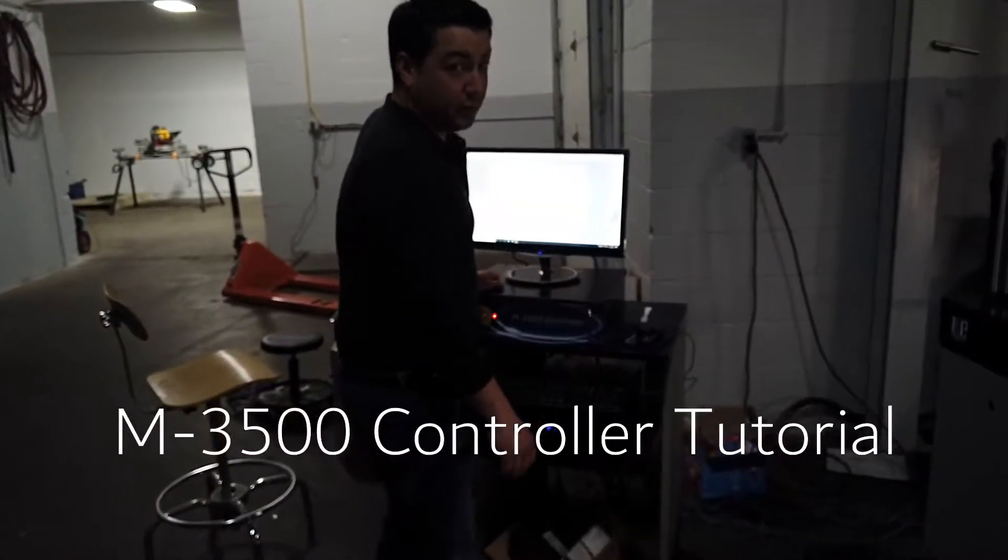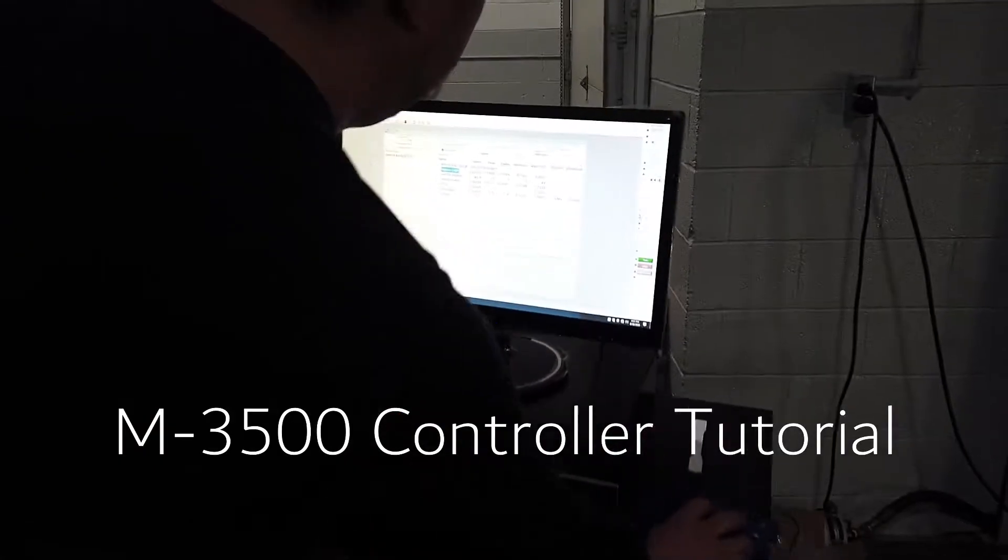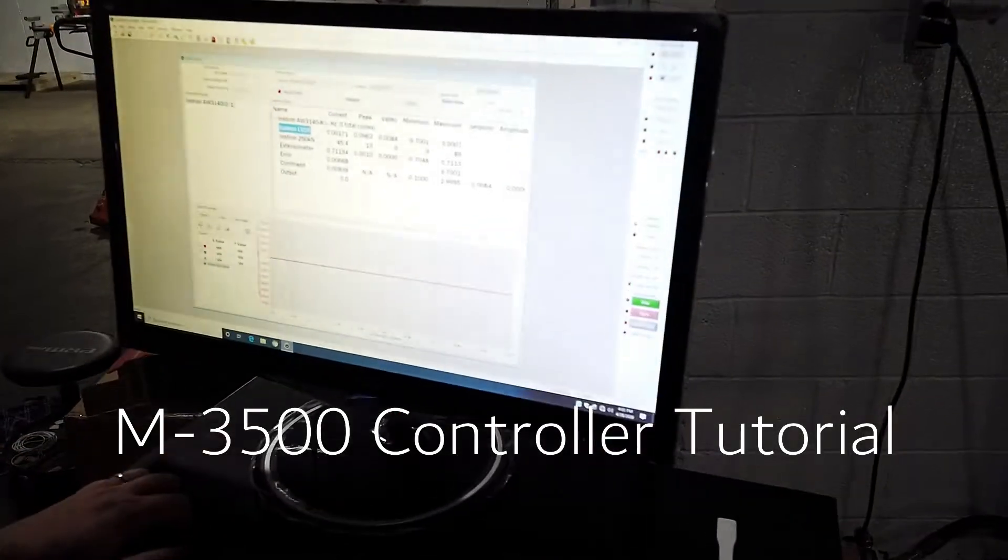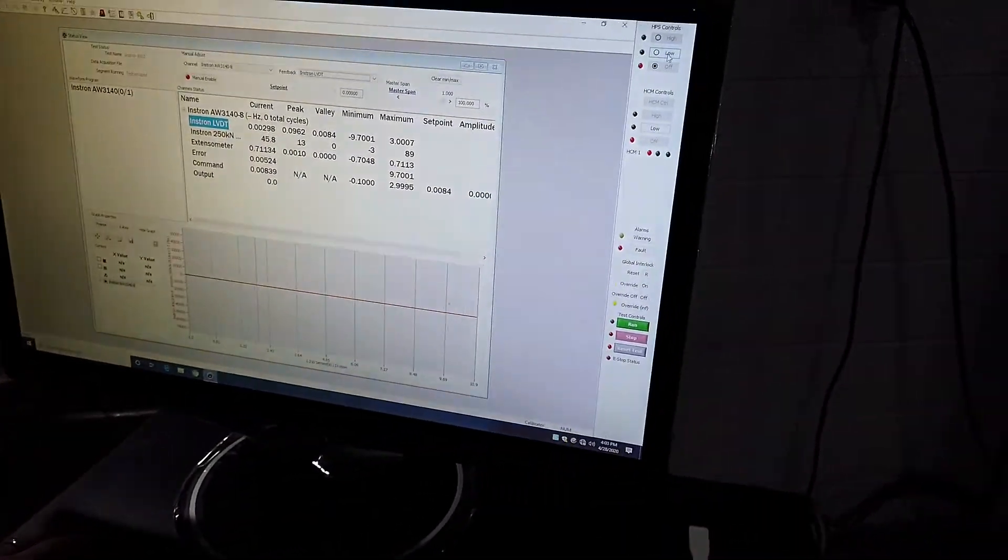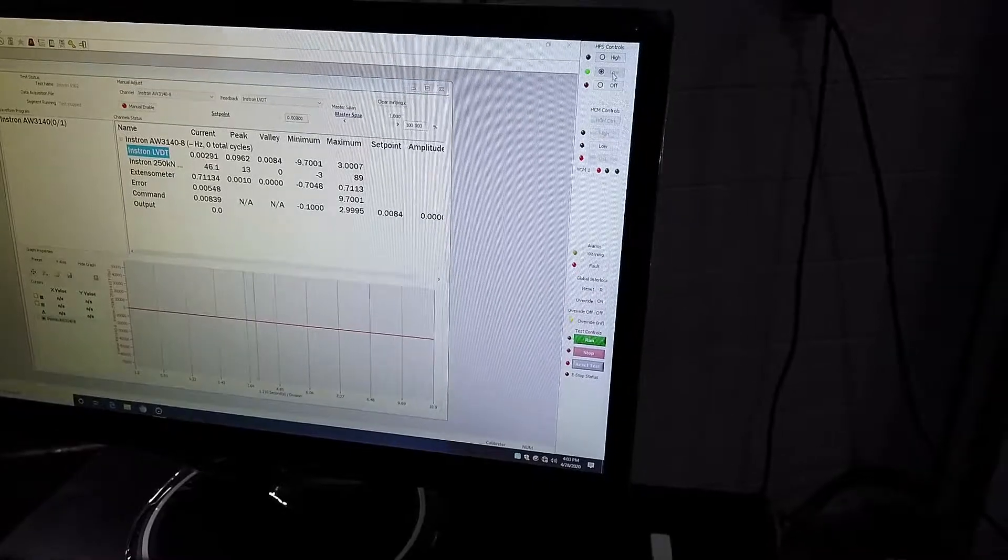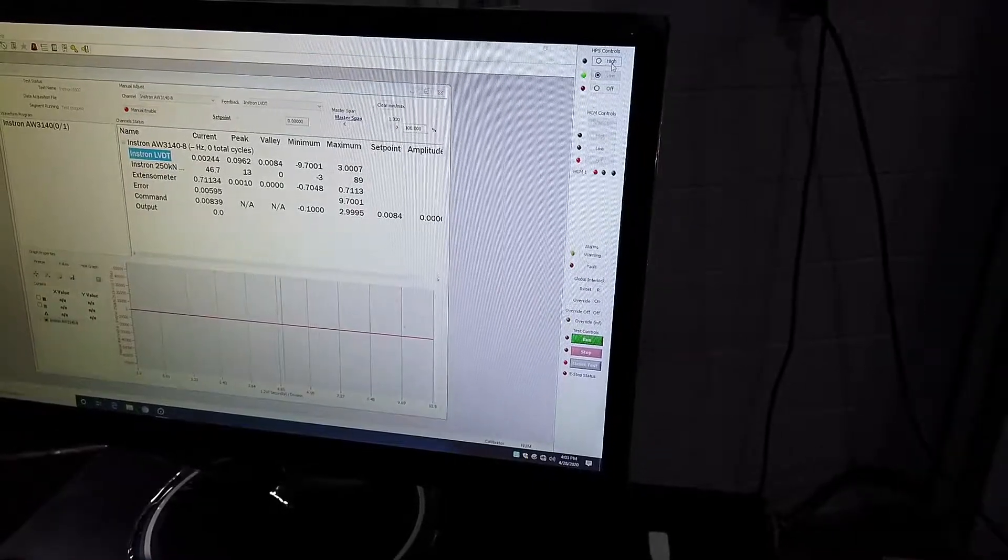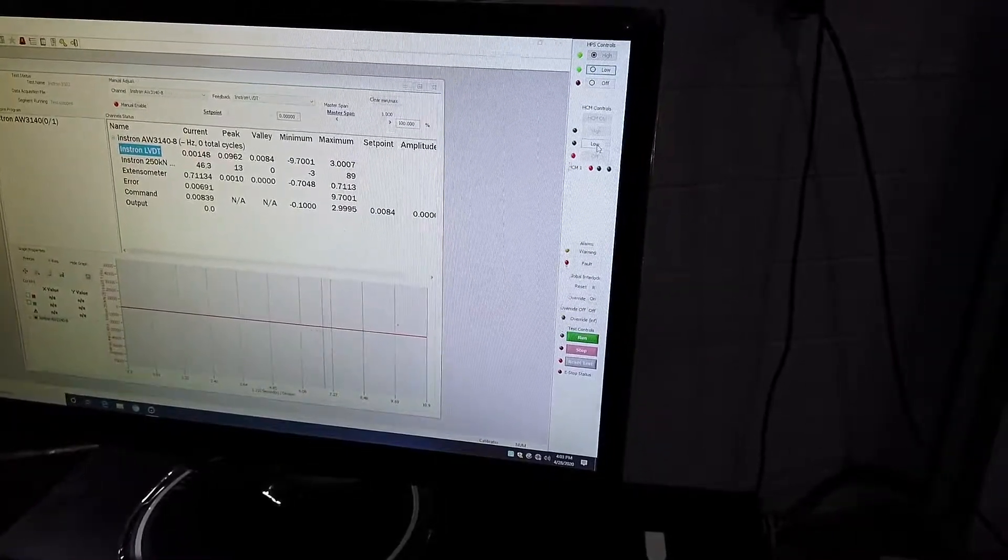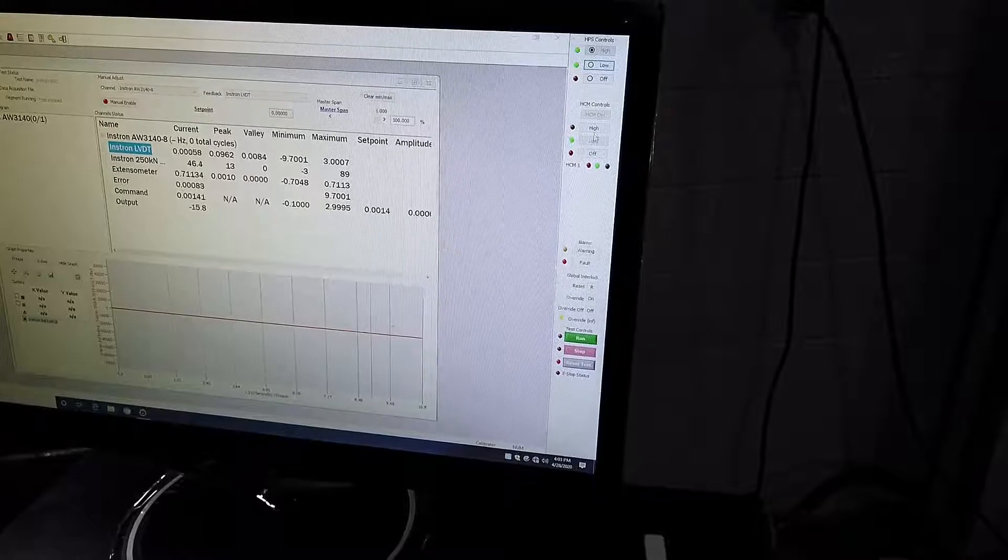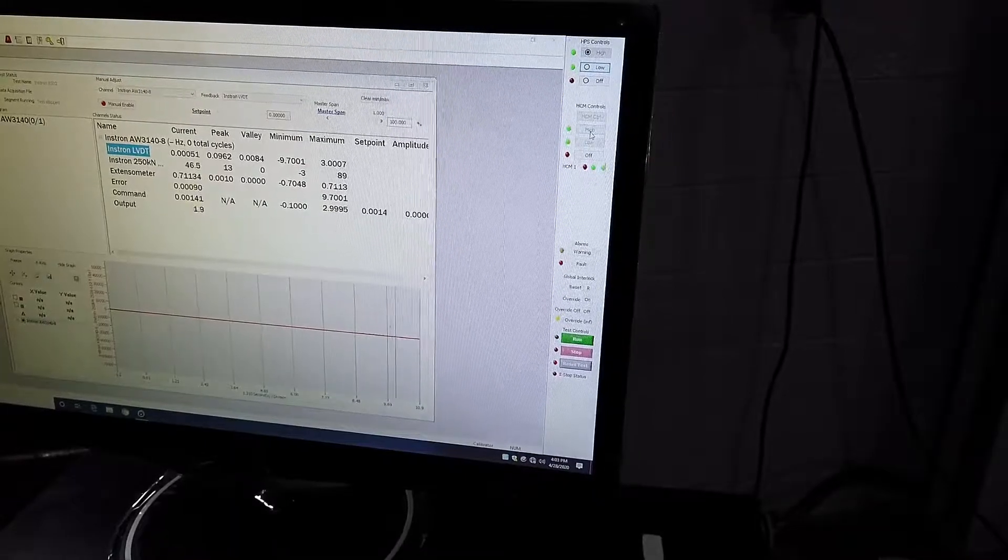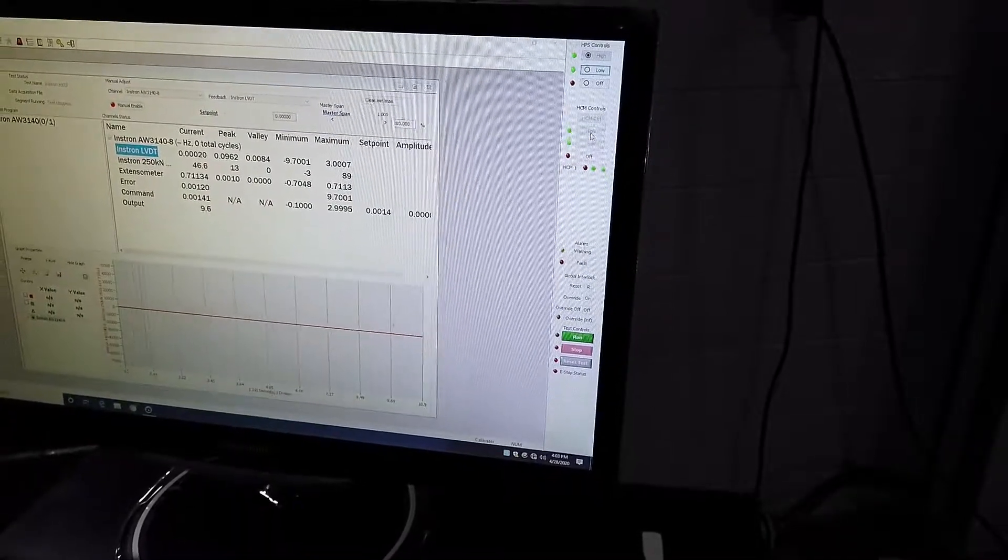Hi there. I'm going to go over a quick tutorial on start-up for the M3500. Start with HPS control. Turn the pump on low, then take it to high. I'm going to turn our HCM from low to high. That gives us control.